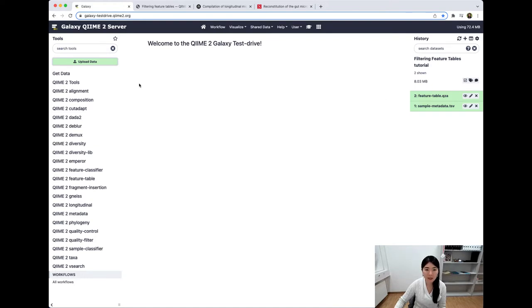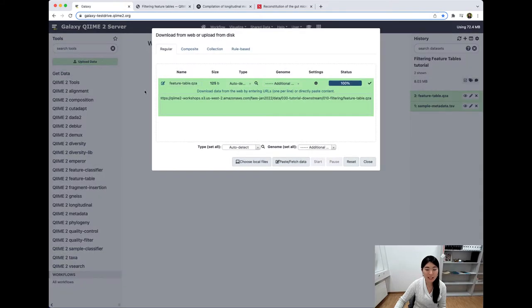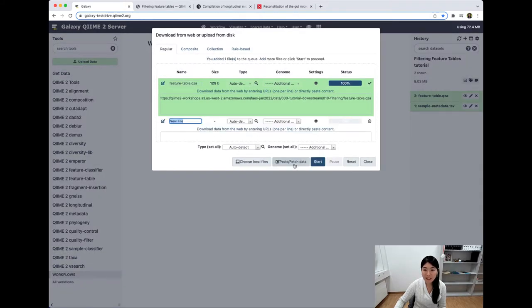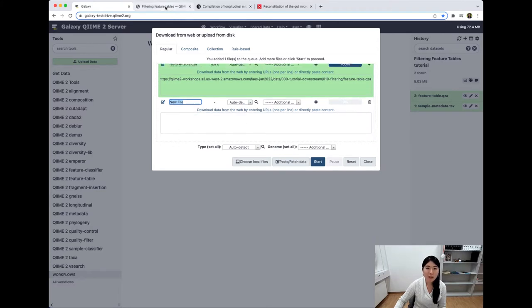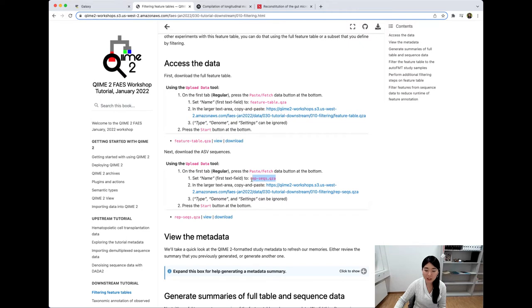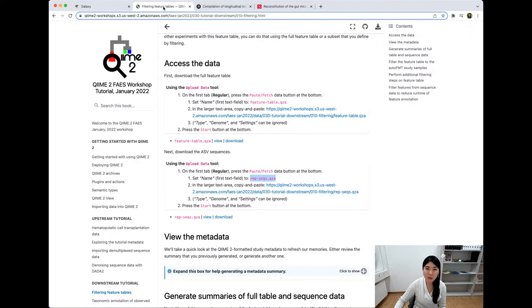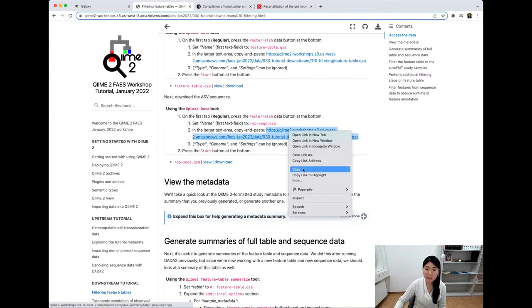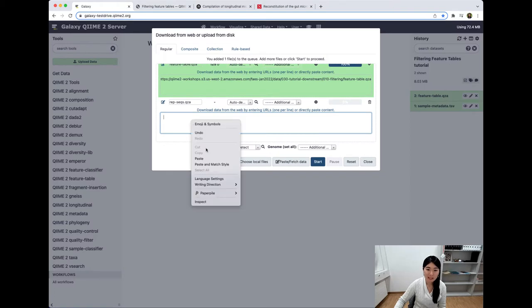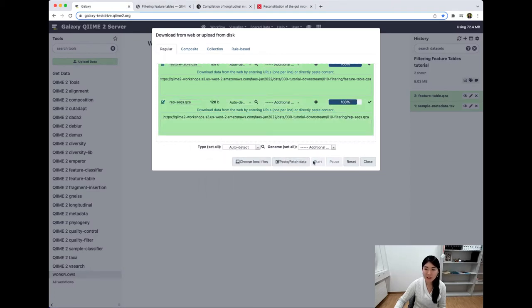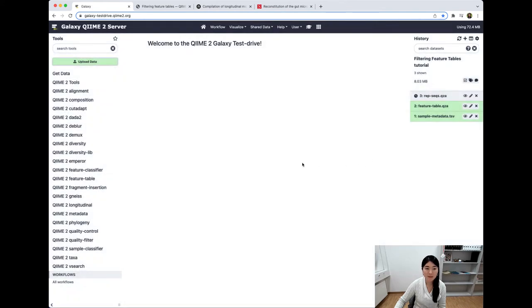The second file we want to upload is going to be the ASV sequences. So we'll go to upload data again, click on paste and fetch data. This new file name we're told is rep-seqs.qza, and this represents all of the ASV sequences that we're interested in. Copy that, paste. And in this text field, we want the link to where the file is — copy that from here and also paste. Press start. Great, now that's been uploaded.